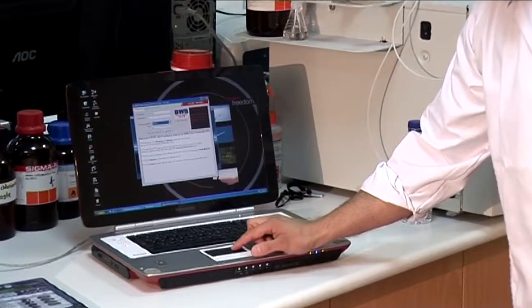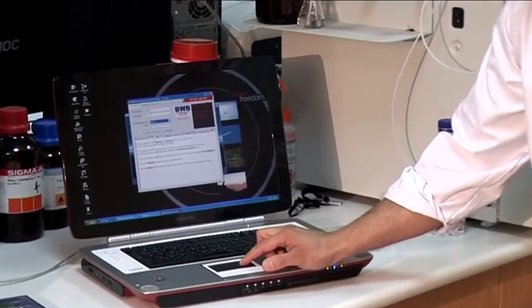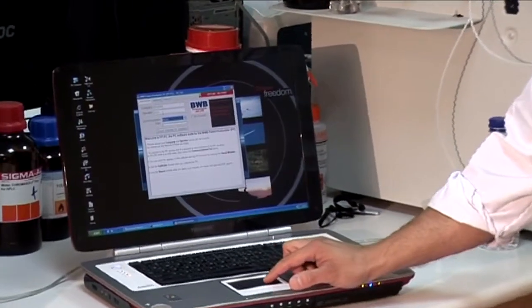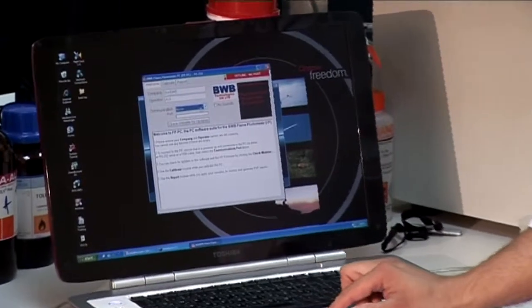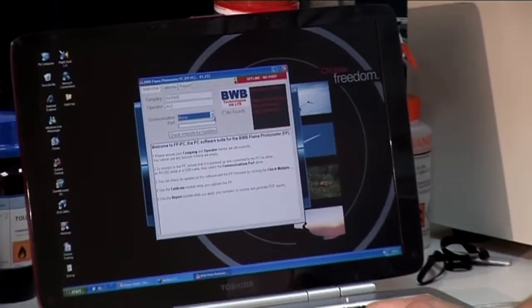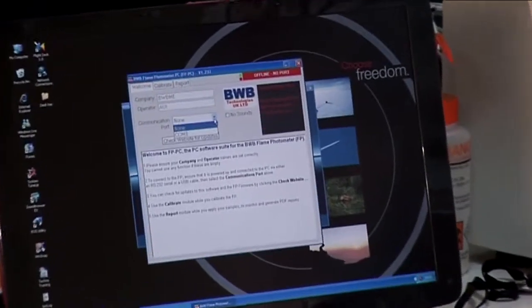Now we're ready to take some measurements. Start the FPPC software and begin to realize the full potential of this free feature.